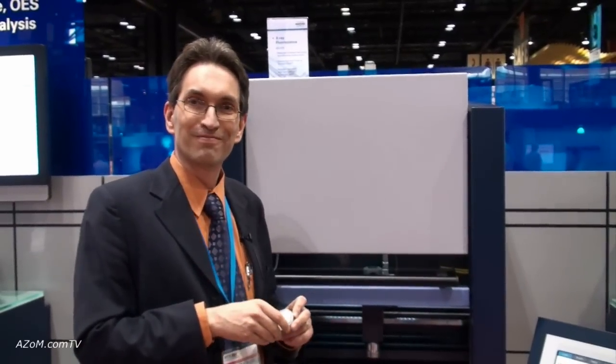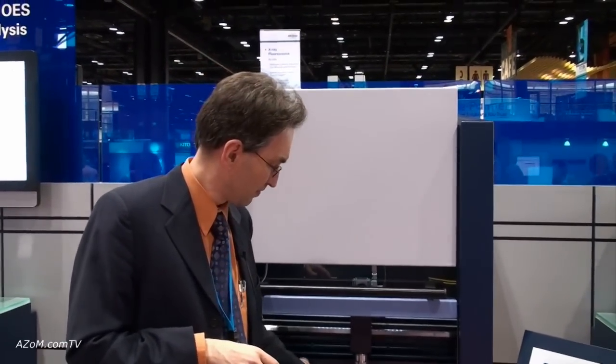Thank you very much. Alright Alexander, thanks for telling us about your new XRF analyzer for the cement industry.